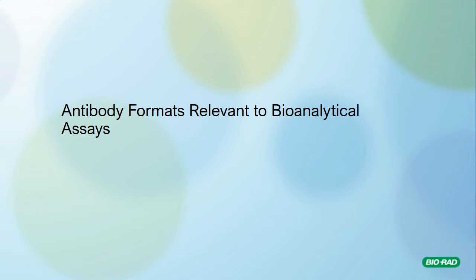In deciding which antibody formats the customer may wish to receive the antibodies in, some consideration has to be given to the assays that those antibodies will be used in and the roles those antibodies will play. So in the next few slides, I'd like to give some examples of typical assays, either that we've worked up ourselves or that we know customers use our antibodies in.